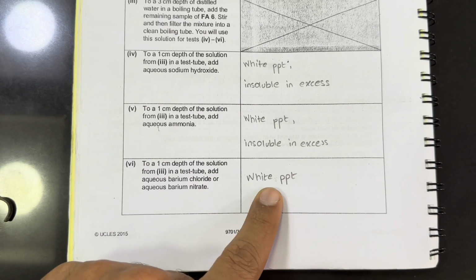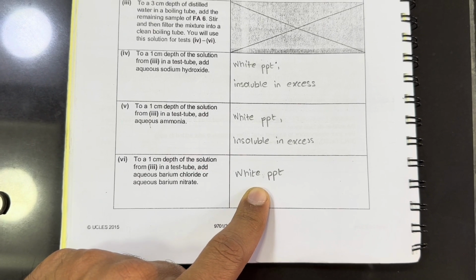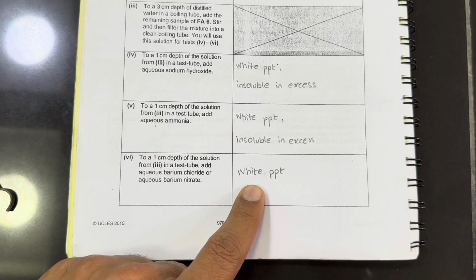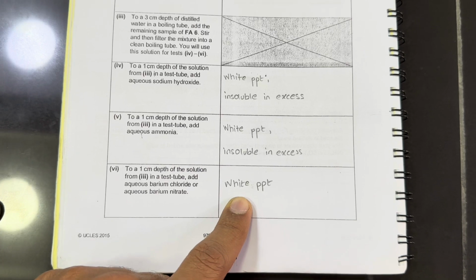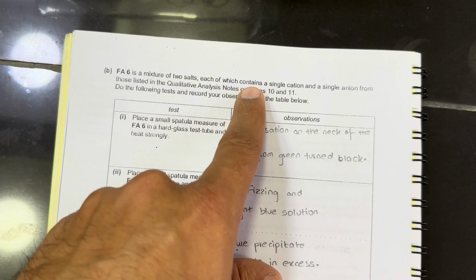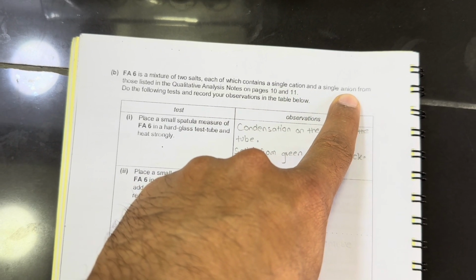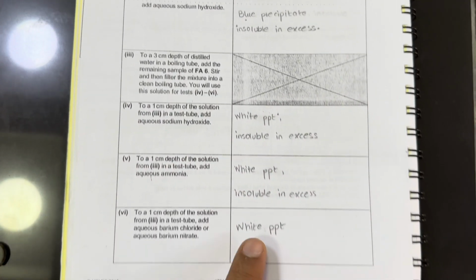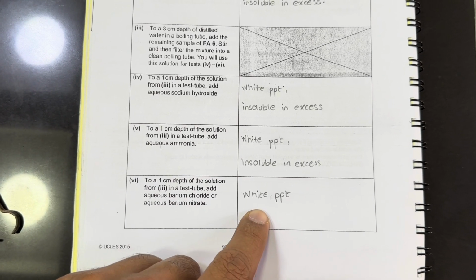So we have recorded here white precipitates formed, which means this salt contains either sulfate or sulfite. So this is one of the anions, sulfate or sulfite. What is the other anion? Because in the question they have said two salts and there are two cations, each cation and each anion means two salts contain one cation, one anion. So two anions must be there. So this is one of the anion detected, white precipitates with barium salt means sulfate or sulfite.